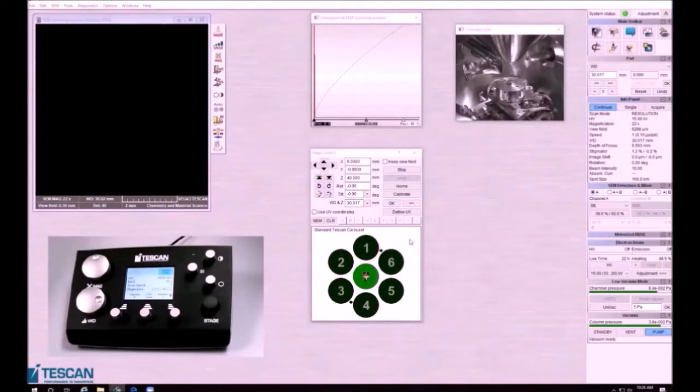Before we turn on the electron beam, I'm going to go through a few things that you'll see when you get the software open. First, you're going to see the chamber view off to the right — this is actually a camera inside the SEM, so you can see exactly where your sample is with respect to the electron beam. We really want to be careful that we do not allow our sample to hit anything within the chamber, including the electron beam. If your sample is larger, you will want to keep an eye on this screen frequently.